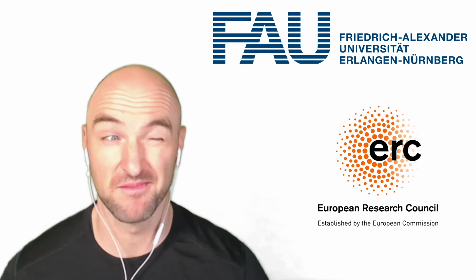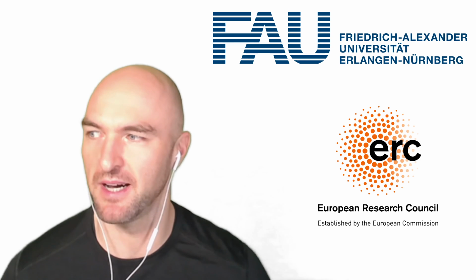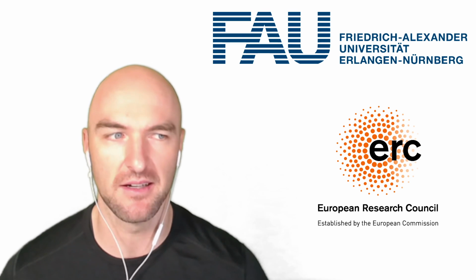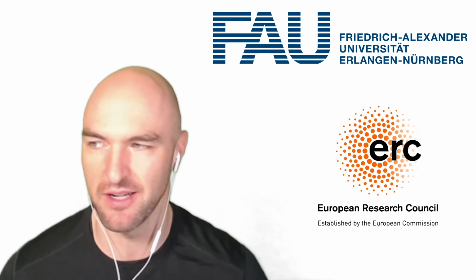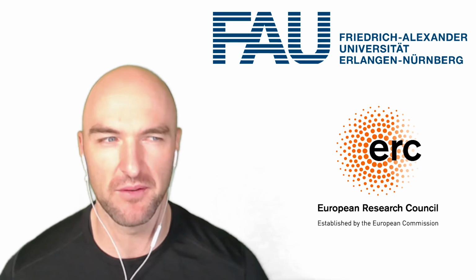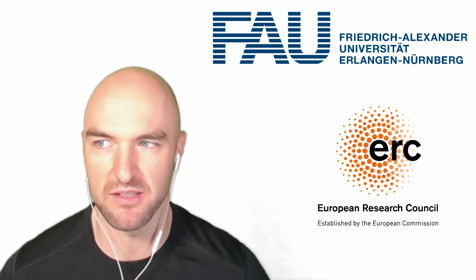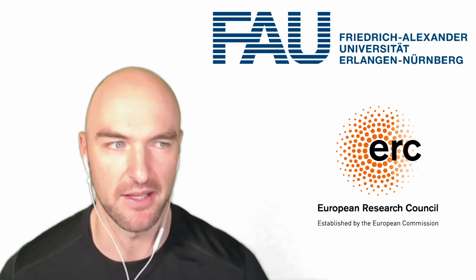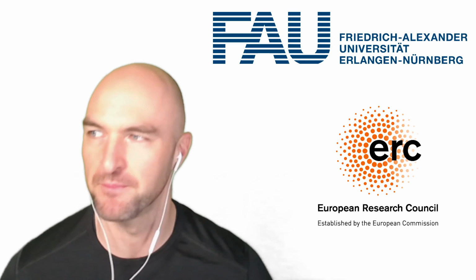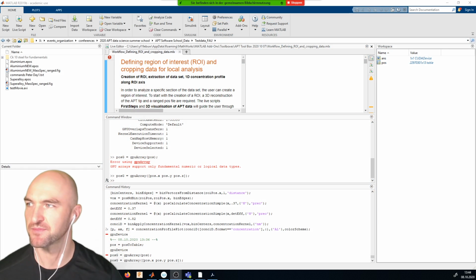We're now at the 7th part of the Atom Probe School, and this part is about concentration profiles and n-dimensional concentration analysis, or generally n-dimensional analysis. I think one of the first analyses we might want to do is a field desorption map, and for that, aluminium is probably not a bad idea. Anyway, let's get right into it.